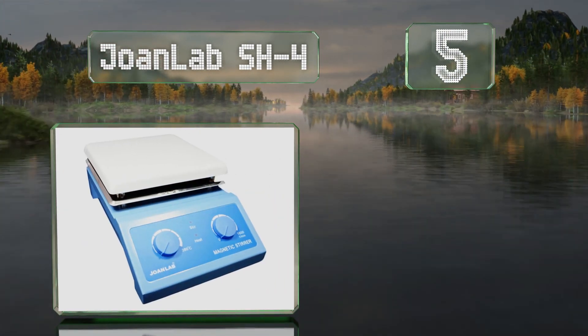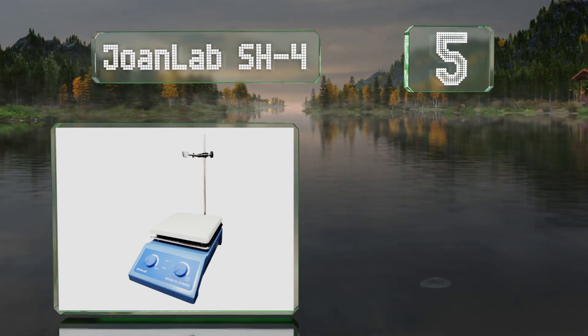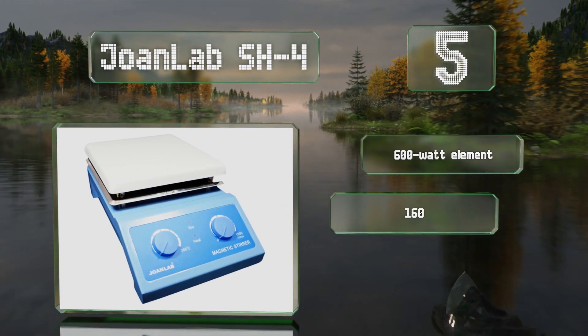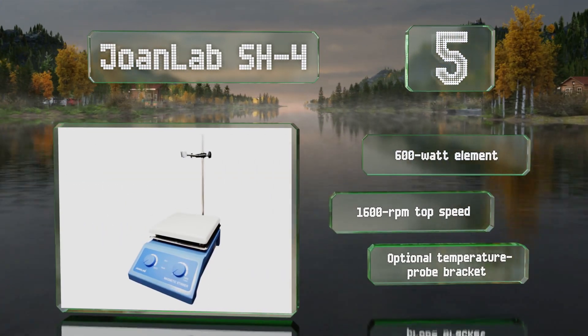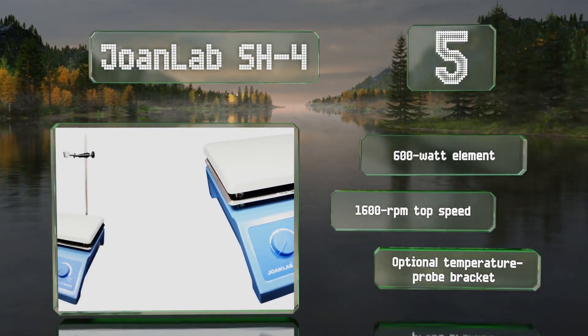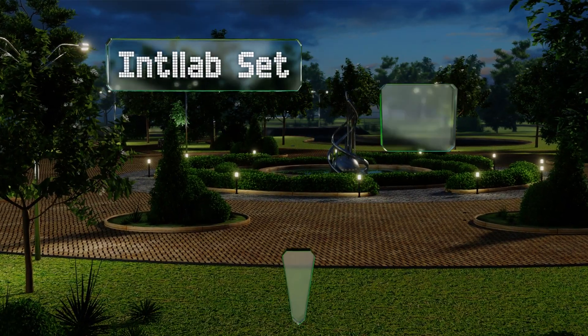Moving up our list to number five, the Joan Lab SH4 is designed to automatically shut off when its temperature rises above 700 degrees Fahrenheit, so you don't have to worry about it overheating. A super strong magnetic field means that the bar shouldn't escape. It's equipped with a 600-watt element and a top speed of 1600 RPM. There's also an optional temperature probe bracket.